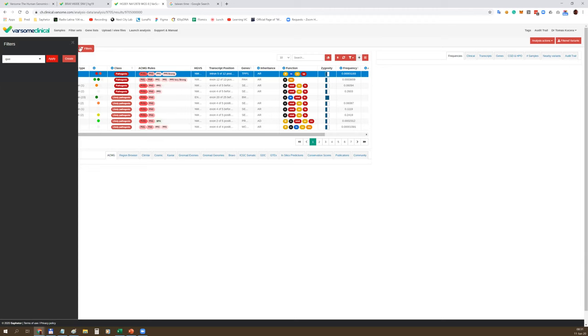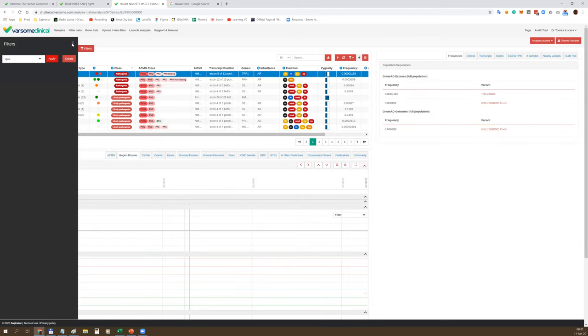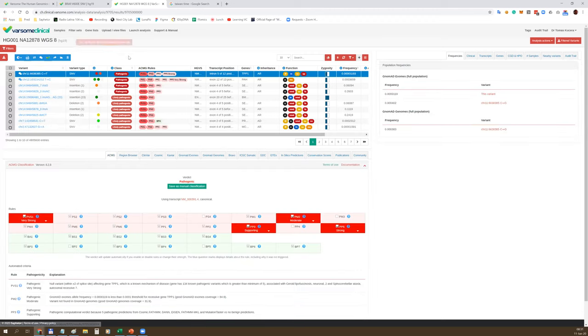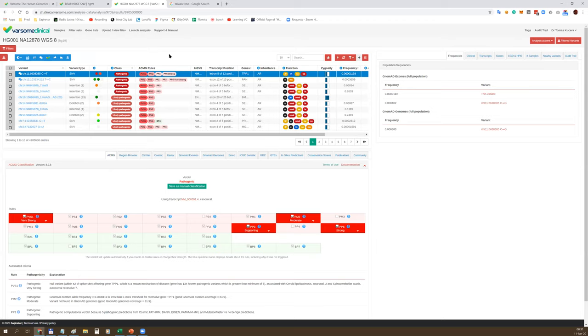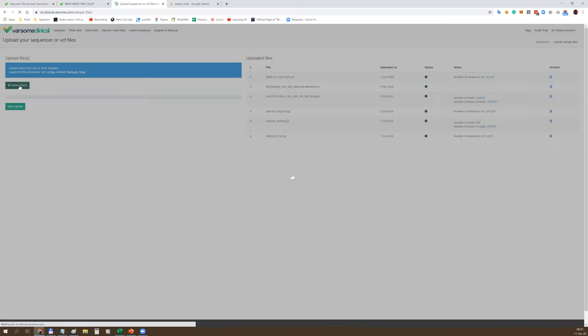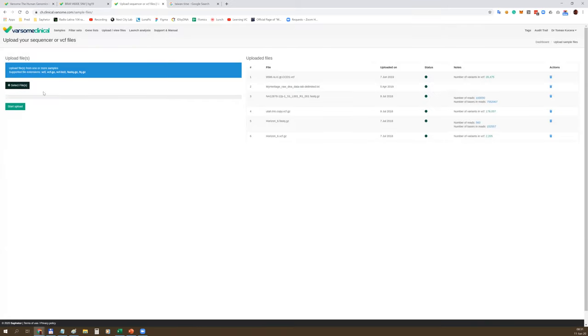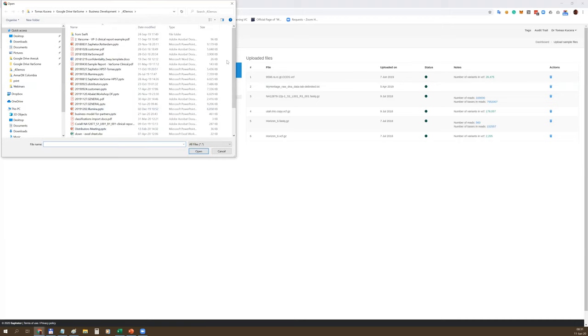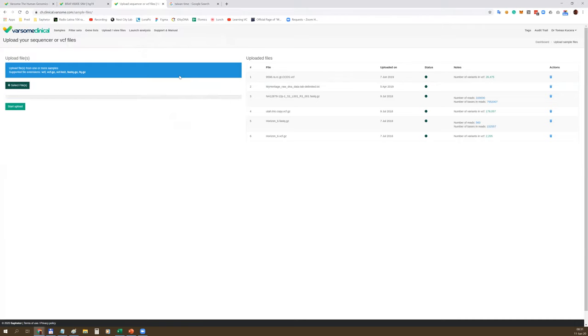On top of the free platform, we have built Varsom Clinical, which is a complete solution for interpretation of NGS data from FastQ or VCF. I don't want to go too much into detail - a full demonstration takes an hour. However, I'd like to focus on the most important features or aspects of the platform.